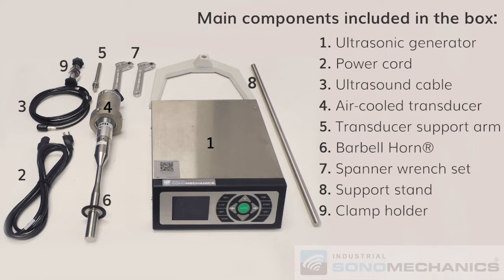Note that the transducer and the barbell horn are shipped already assembled with each other and will together be referred to as the ultrasonic stack.